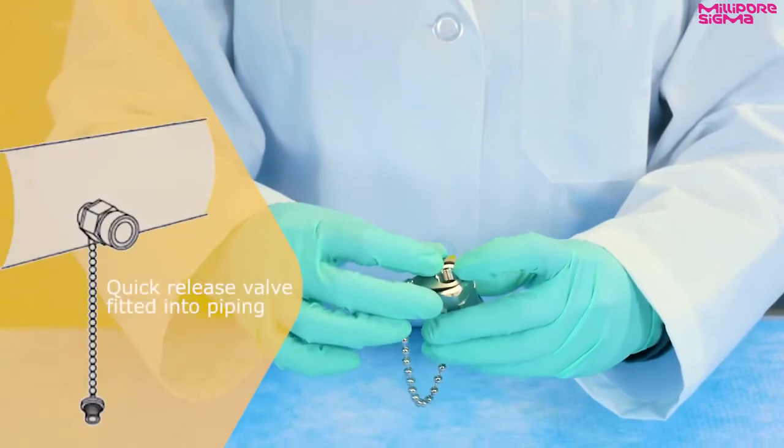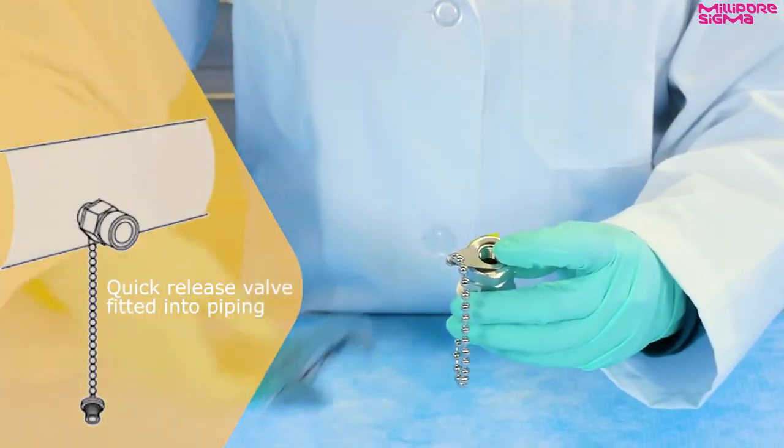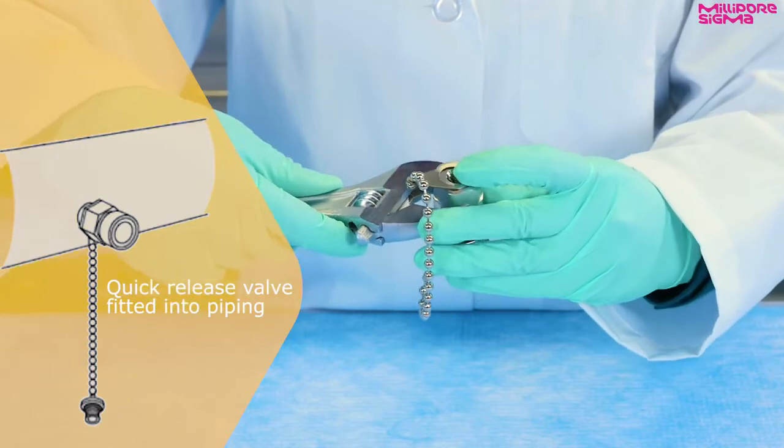Attach the quick-release valve into your system using an adjustable wrench if needed. Inlet pressure should not exceed 100 psi.